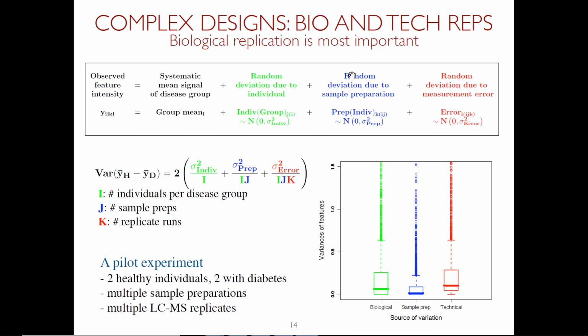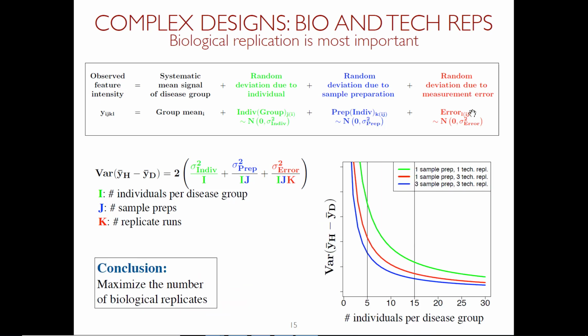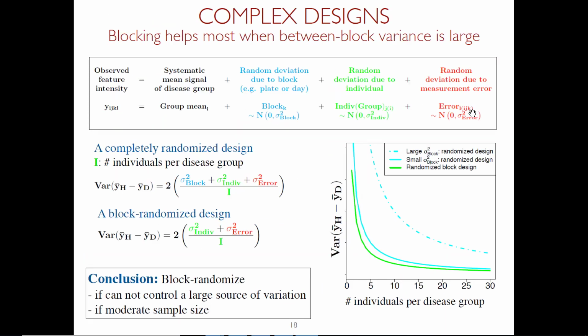But what you're asking is actually quite meaningful because, you know, if I have 1,000 proteins, I will have 1,000 of those variance components, right? So how do we work with that? So what we actually do in MSstats, we will take the median, or maybe to be conservative, the 75th quantile, or something like that. We will just use, to be on the larger side, so on the more conservative side, whatever is representative of the experiment.